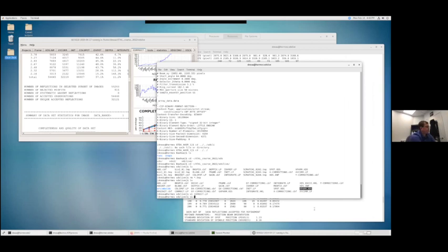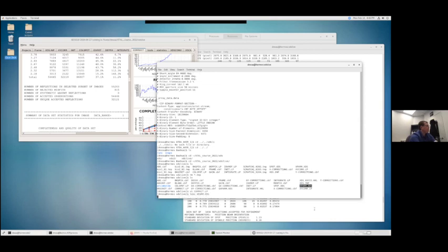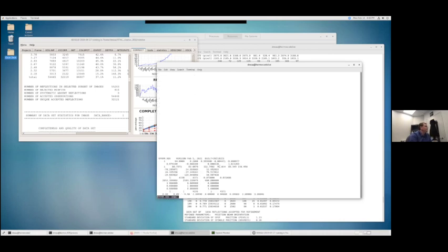If I just look at that, this is just a format, and it's telling XDS information about the starting image number, the starting oscillation, or the starting omega, the oscillation in omega, and some other, so this first line is just about the image frames.